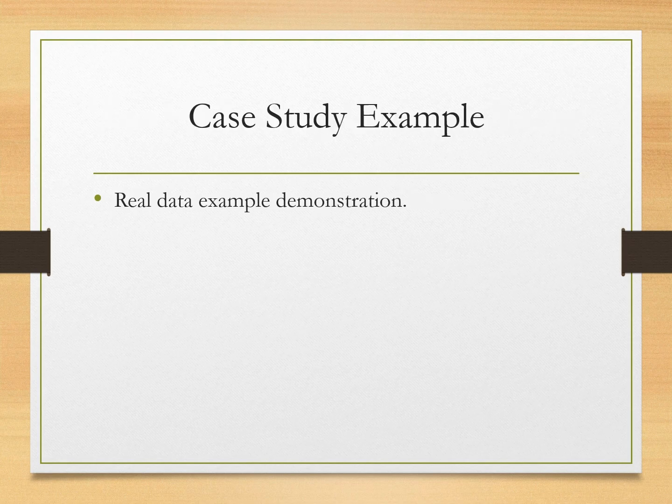So we reviewed the UV visible spectrophotometer and Beer-Lambert law, instrumentation, working steps, errors, precautions and applications.